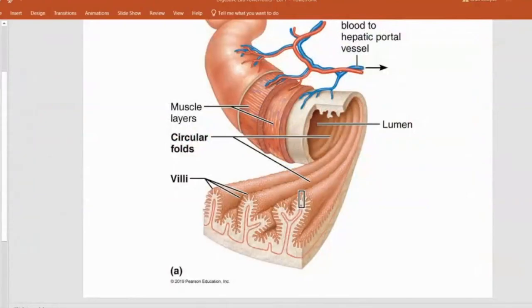Here's the small intestine generically. Not much testable on this. A little bit, not much. Notice the lumen. They're also reminding us, even though I didn't label it, serosa, longitudinal and circular muscular layers, submucosa. They didn't label it because I'm not going to use this picture for that anyway, but I wanted to say it for you to remind you. All these have layers. So then this here is the mucosa with its folds.